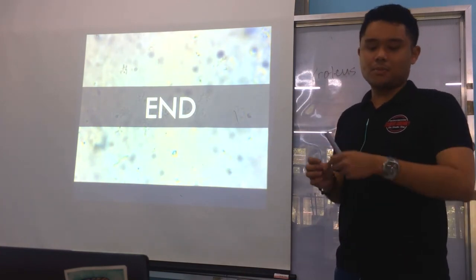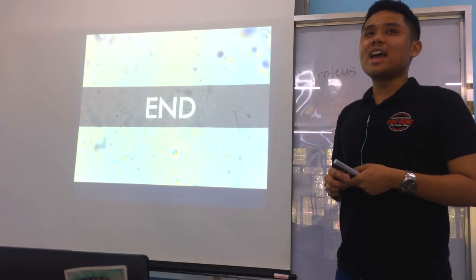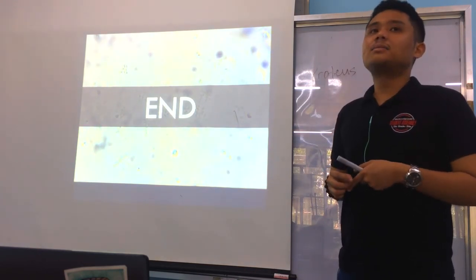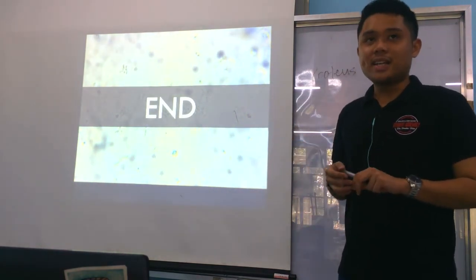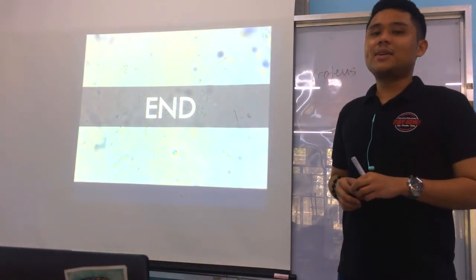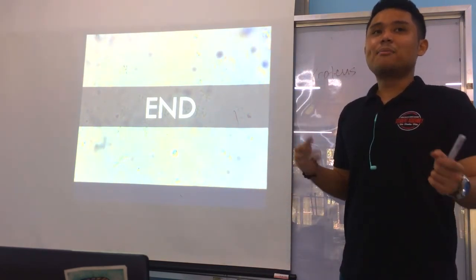Again, it's very short lang po, like very short lang. So again, it's a test to detect motility. Alright? But again, in routine lab, usually hindi na mag-hanging drop. Mu-opt na lang tao katong SIM because again, it's very easy to manipulate and very easy to interpret, and it saves time. Okay, right. So that's all for bacterial ID through smear prep and slide preparation, guys.